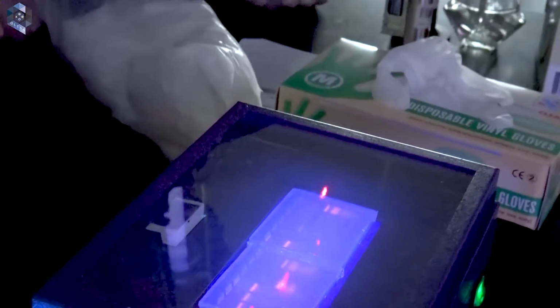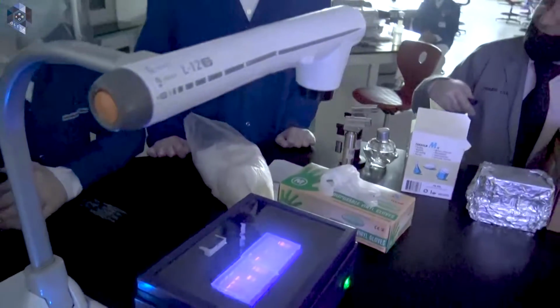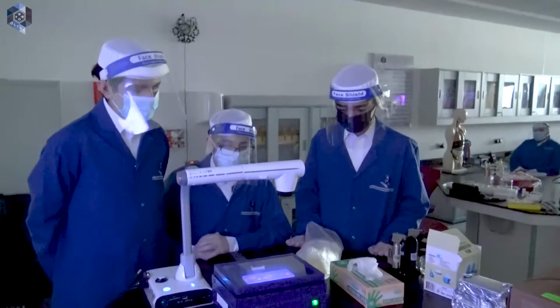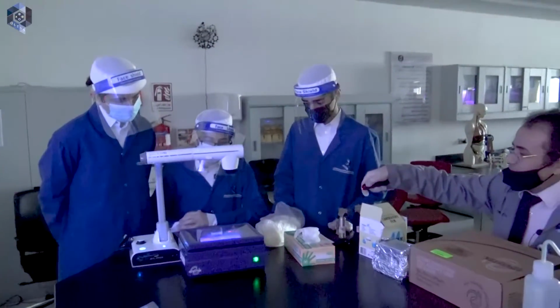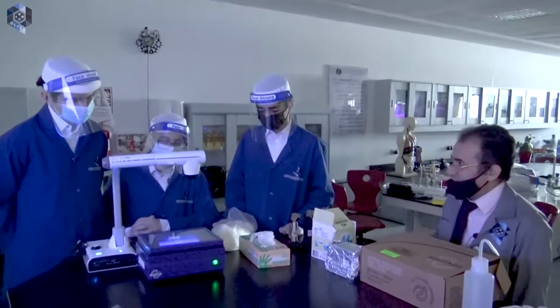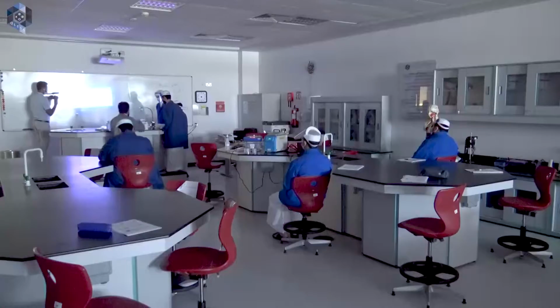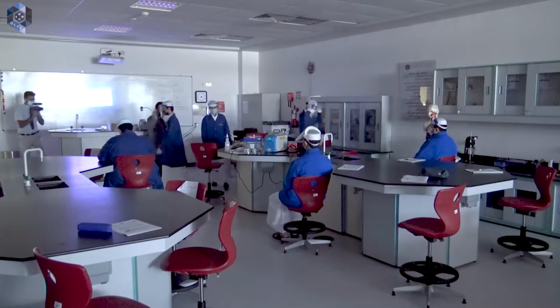Now, here they are separated. These bands represent the recombinant DNA plasmid. Which is heavier, which has more molecular weight? The recombinant DNA. That's why it migrated less or more from the wells? Less distance, okay? Later on, by the end of the next lab, you will measure these distances and plot the graph, okay? Thank you. Step back, please.